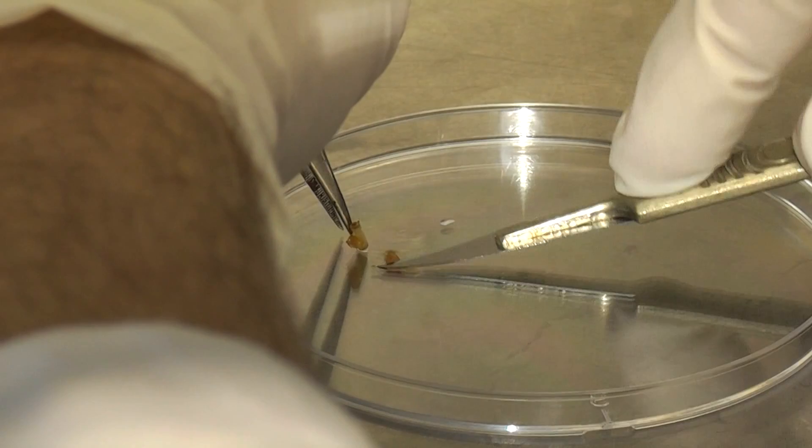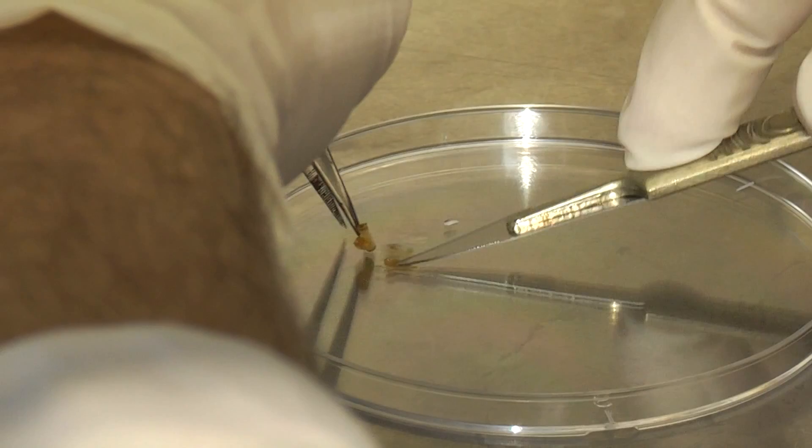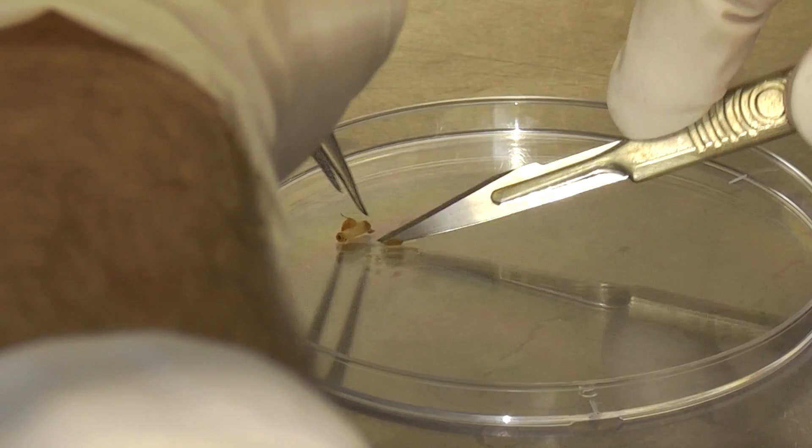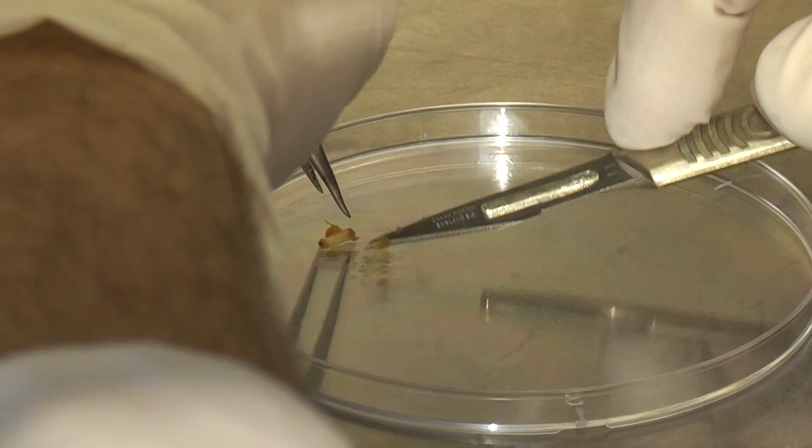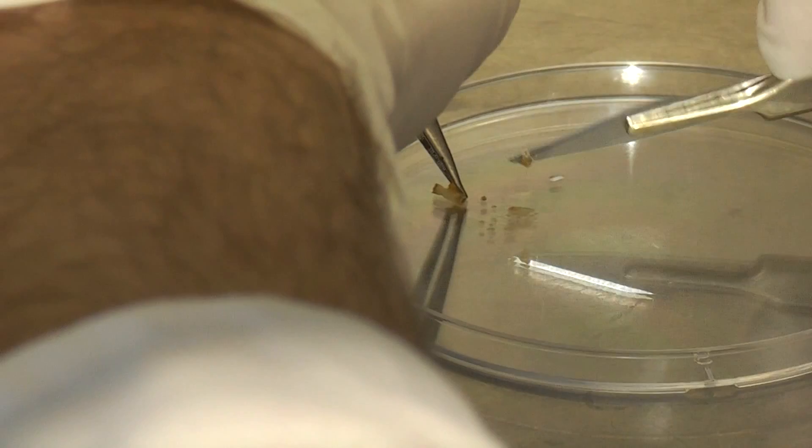So what I'm doing now is just squashing the nodule after I've cut it open. I'm squashing it so that I end up with a little bit of liquid here, and that liquid will contain the rhizobia that were present in the nodule. And now what I do is take those two away. Now they're not sterile anymore so I'll have to use sterile ones before I do the next nodule.